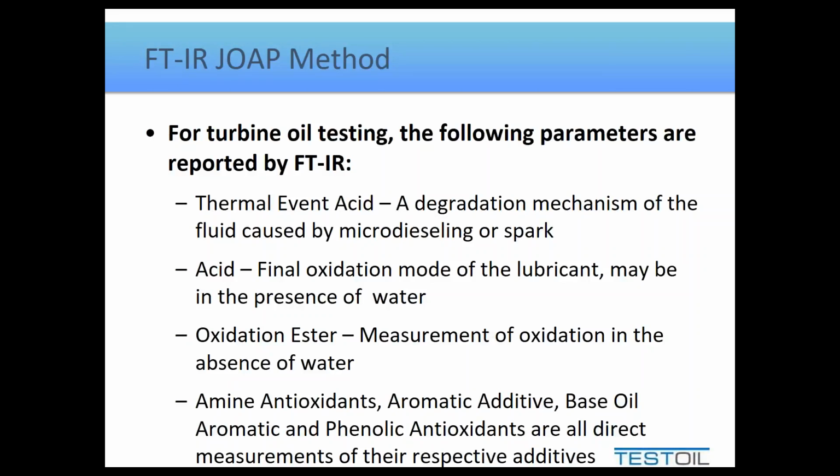If the phenolic value drops off, this is considered to be okay. It's the more sacrificial of the two additives. It's the aminic value that's providing you the strongest protection and the longest life. So with that, that is the end of FTIR.